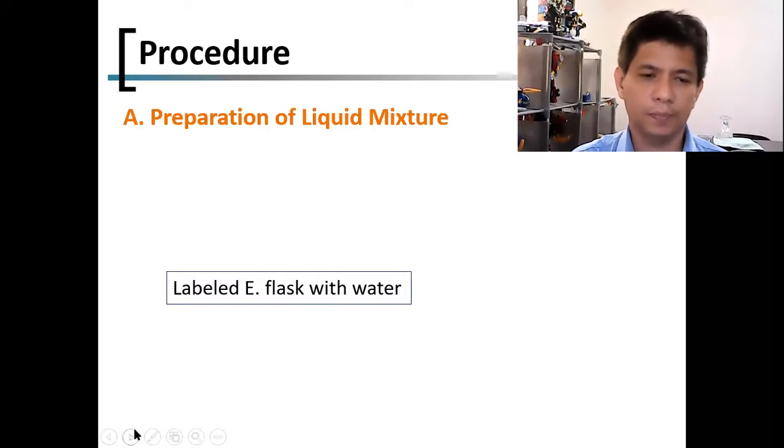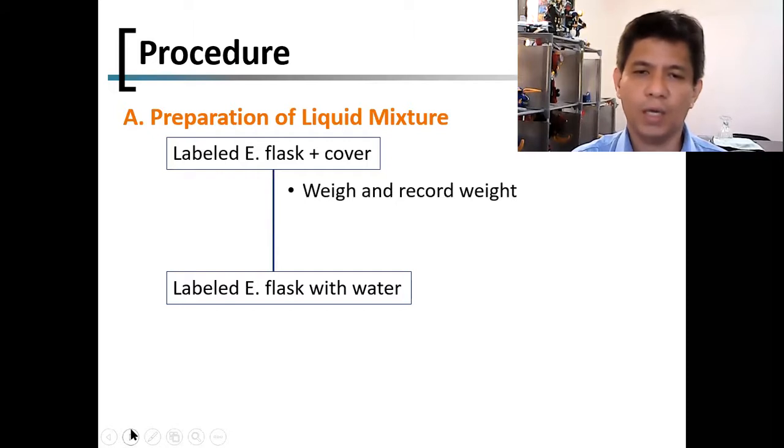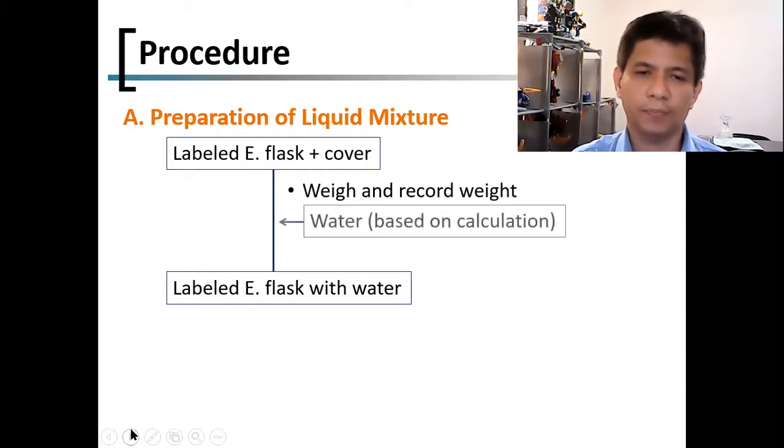So this is the procedure. You need to label the Erlenmeyer flask. Okay, so let's start with the labeled flask with cover. And then we weigh and record the weight of the labeled flask. Then we add water. The volume of water, I'm going to show you later. And then we weigh again and record the flask containing water. Okay. It's quite simple. I hope you can imagine this.